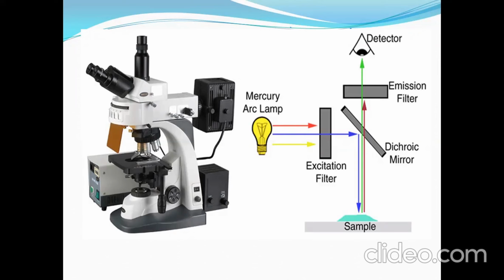higher, which is having the higher wavelength values. And due to that 90% efficiency, this 10% UV light may come to our eyes, which may be detrimental. So this emission filter is very much required. Okay, so this is the basic principle of fluorescence microscopy.